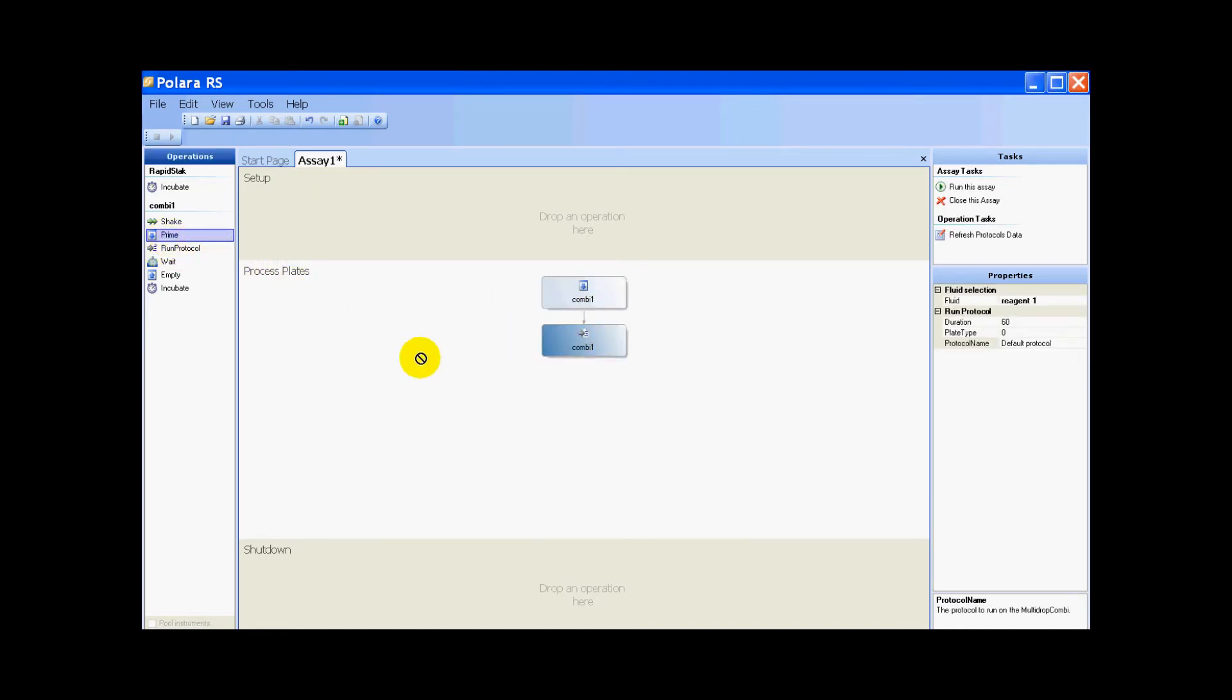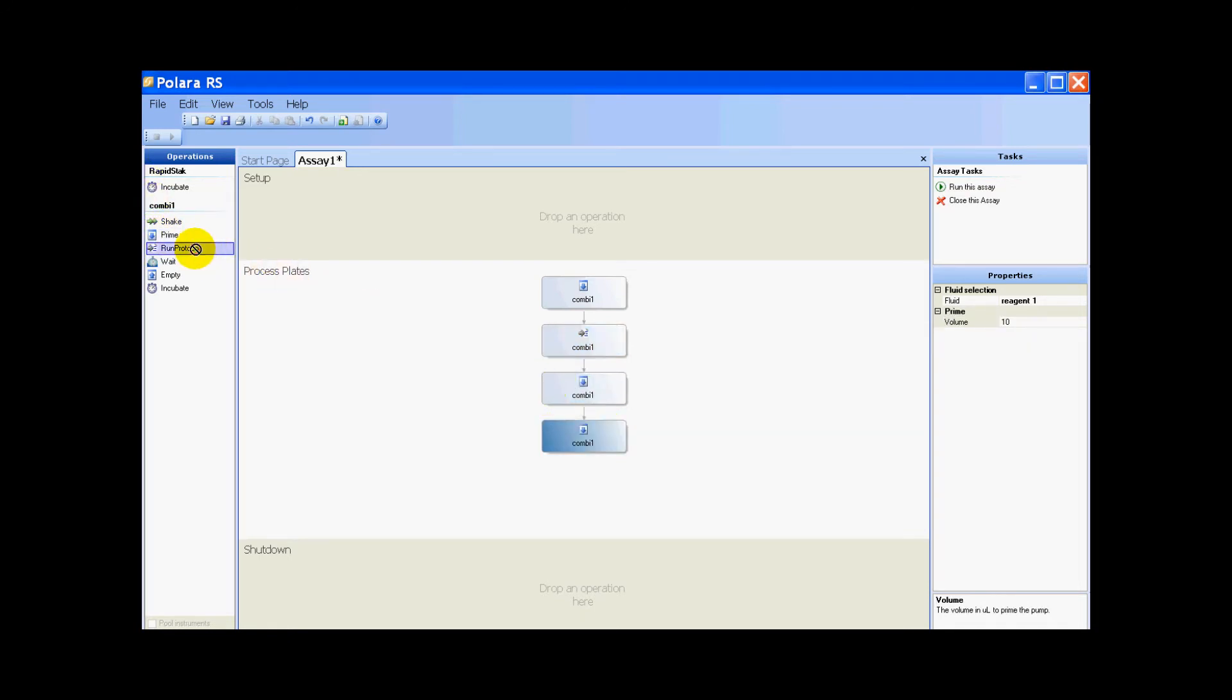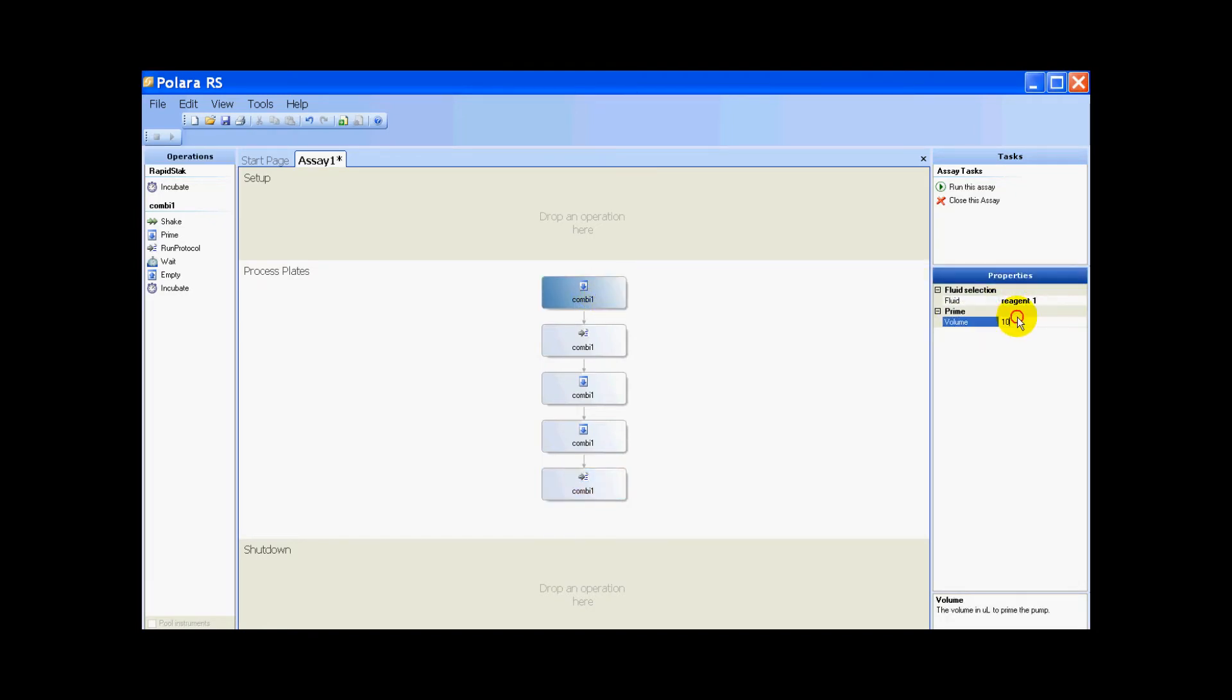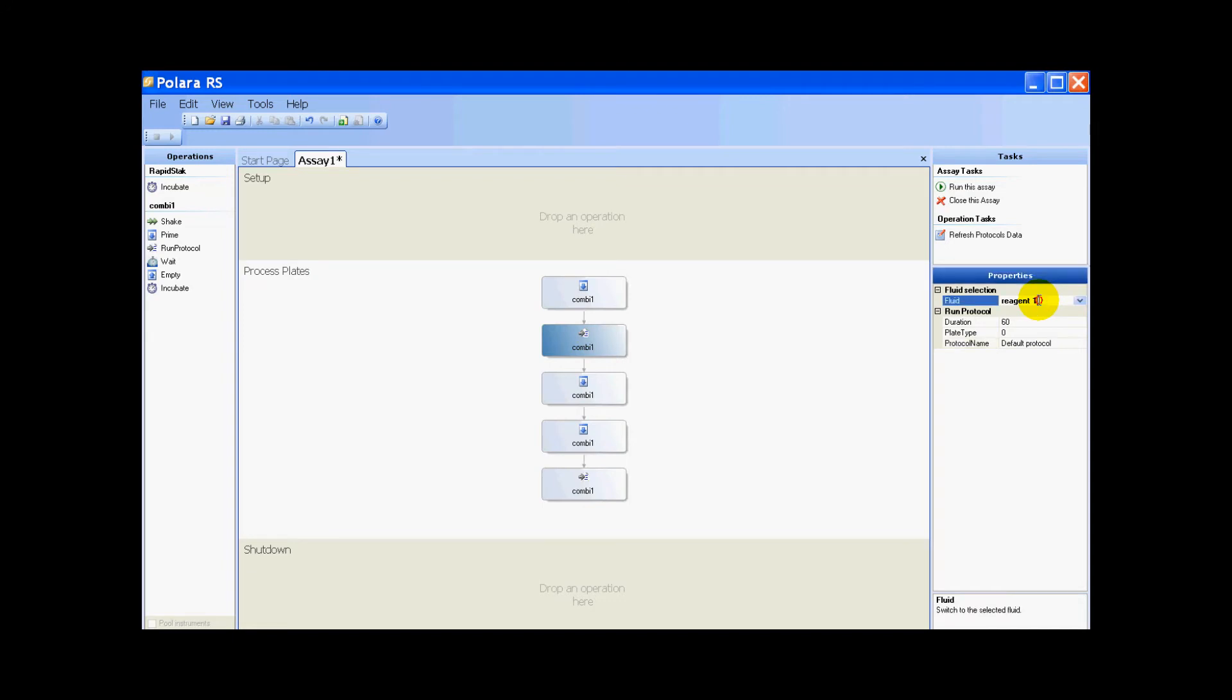I'll show you what I'm going to do. I'm going to take a plate and run two different processes on it. Basically this is a prime. I'm going to prime with reagent one, 1000 microliters. Then I'm going to run protocol on reagent one.